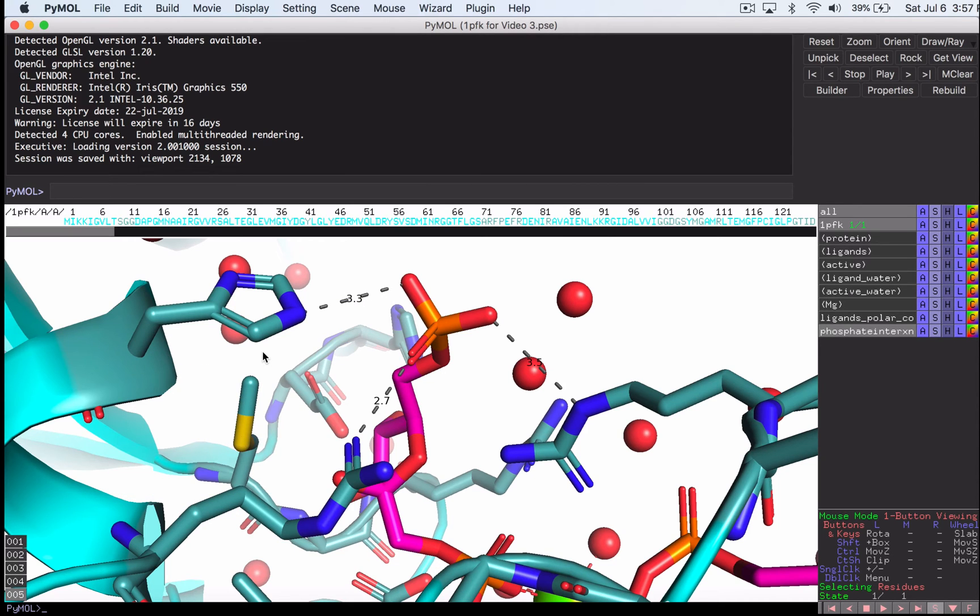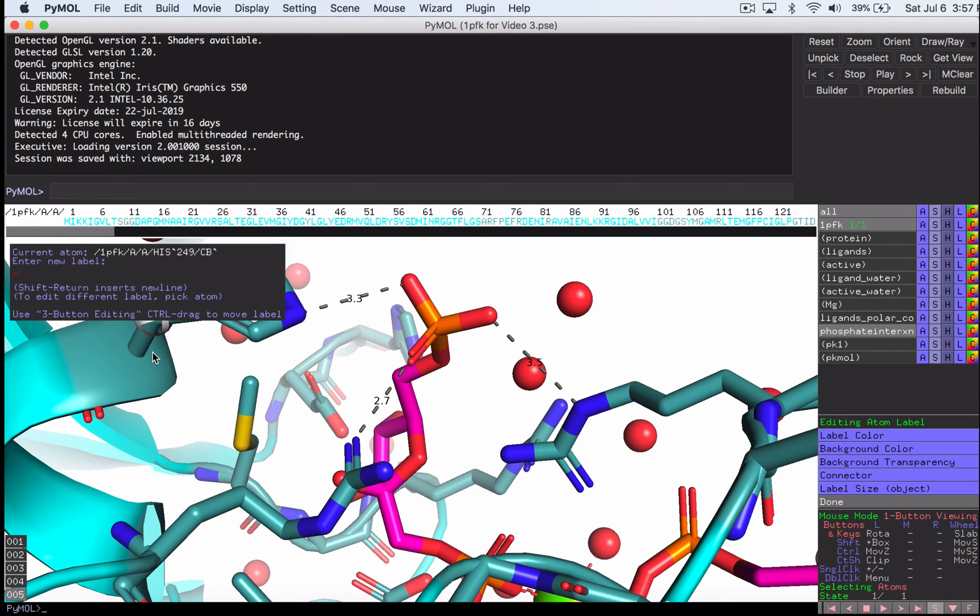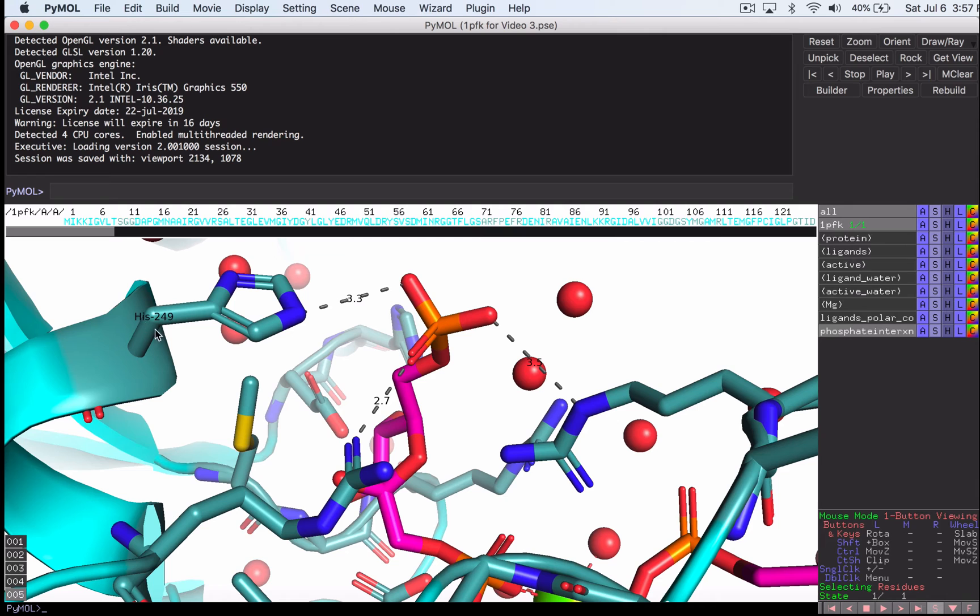Now what most people don't know is that you can actually right click here, and then just say Edit Label. This is what it's going to put as the label, but we can label this residue as anything we want. So say I like to use a capital H and a lowercase is. Maybe my PI wants a dash in there. I can do all of that. Let's repeat this process for the remaining residues.